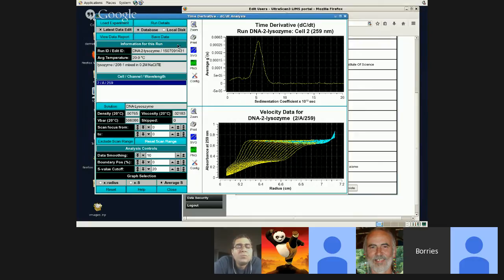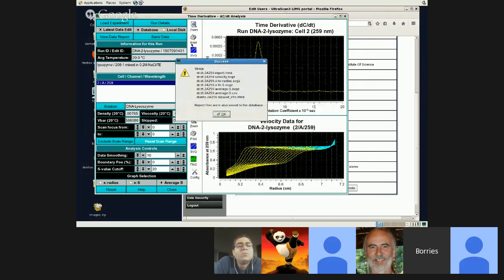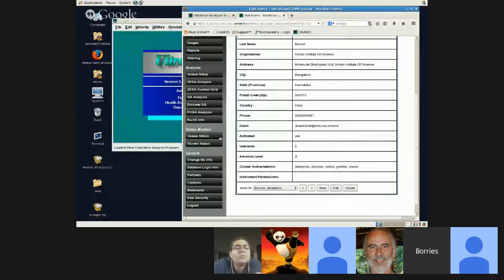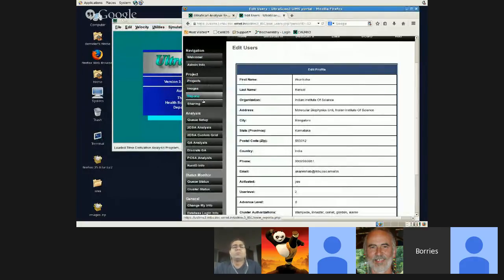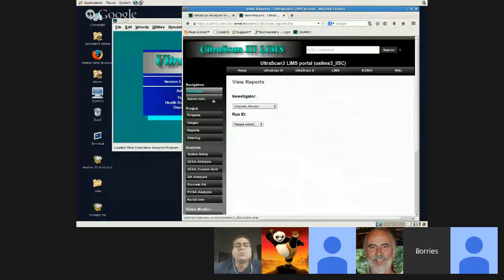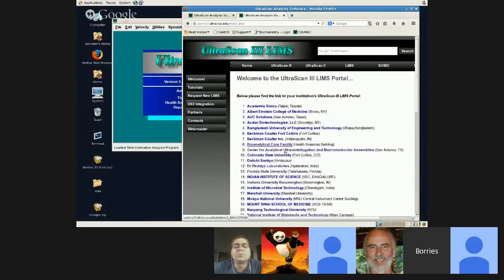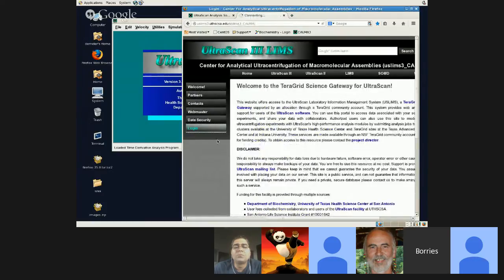If you want, you can save it, and if you save it, it writes a report and saves it in the database, which you can access later. If you go here and you click on reports, I'm still in the wrong database, so I've got to switch over to this one right here. Log in. This is mine.